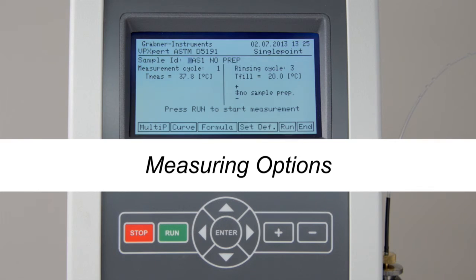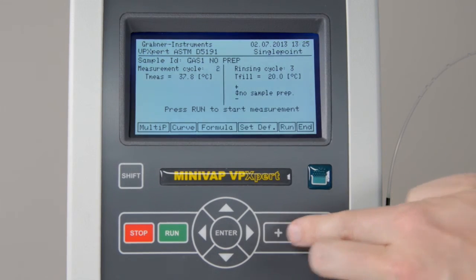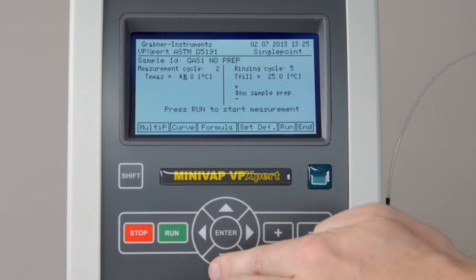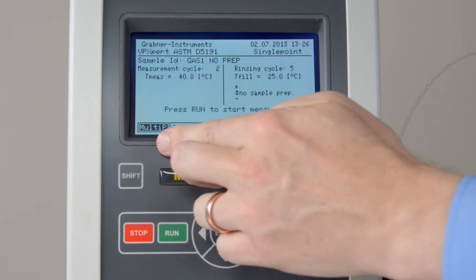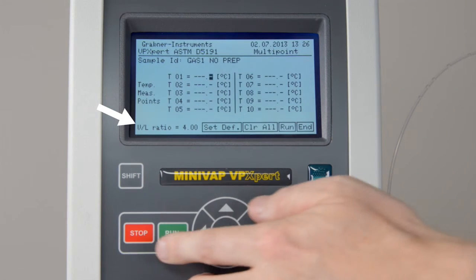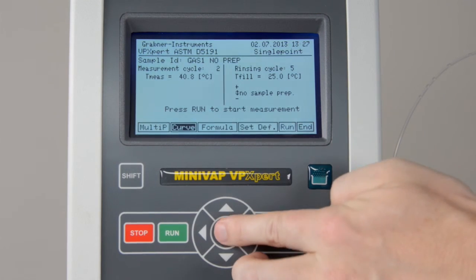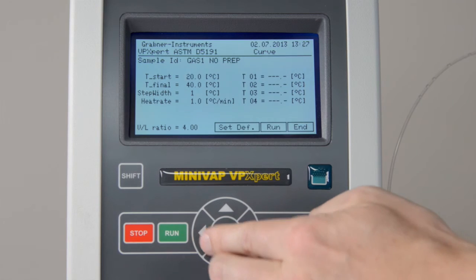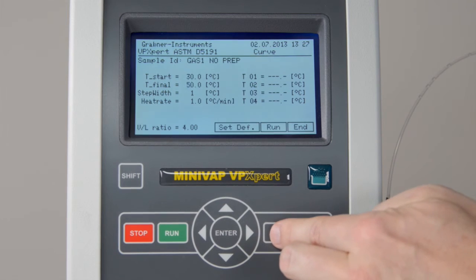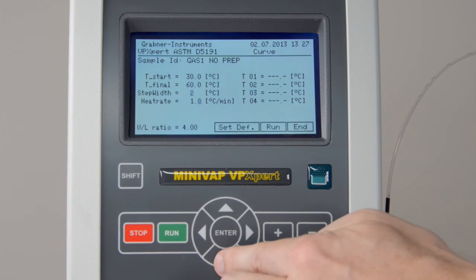Measuring options. On the measuring screen, you can change the number of consecutive measurements, rinsing cycles, the measuring and the filling temperature. You may select multipoint measurements and define a certain V over L ratio. For curve measurement, select Curve to find the start and end point, the step width, and the heat rate of the measurement. The results of the curve measurement are shown in the curve results menu.